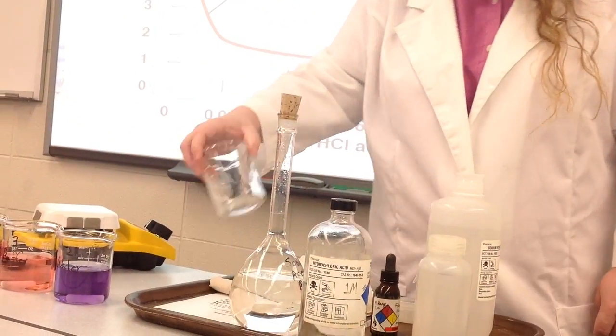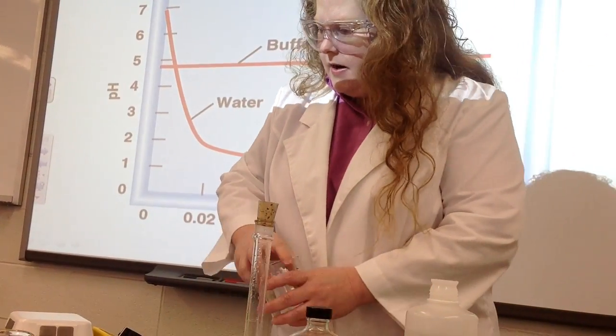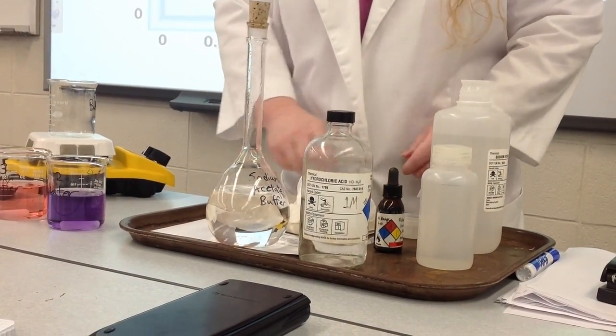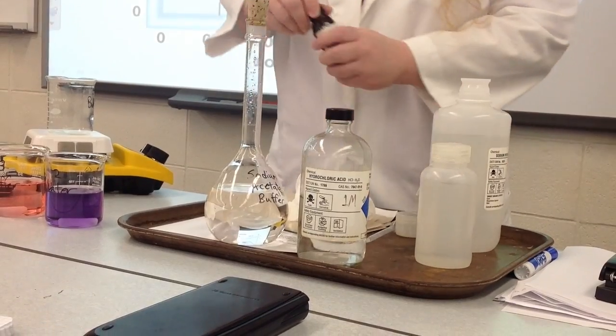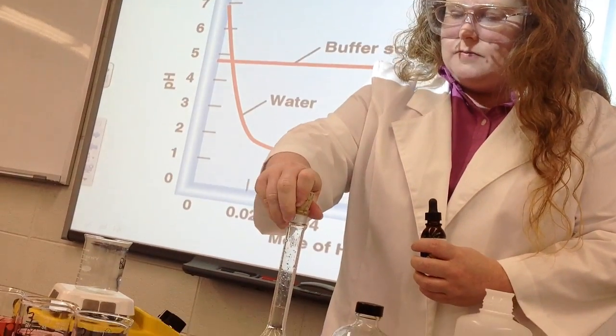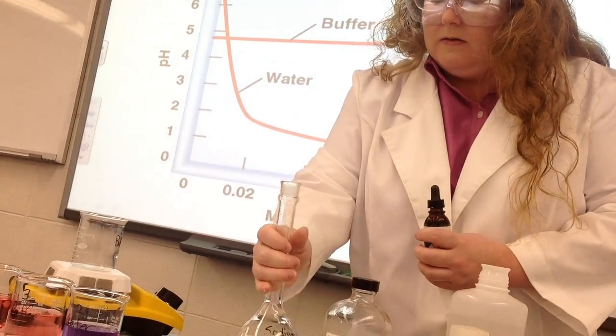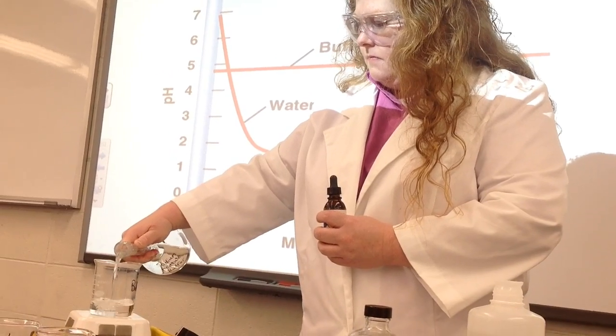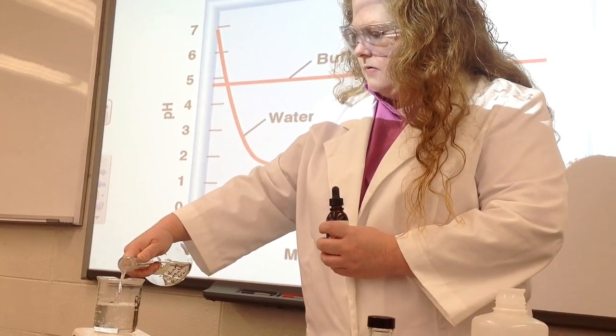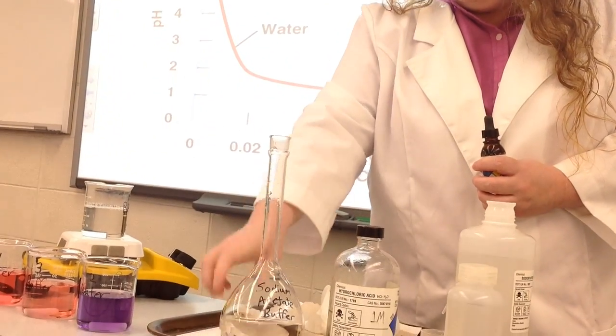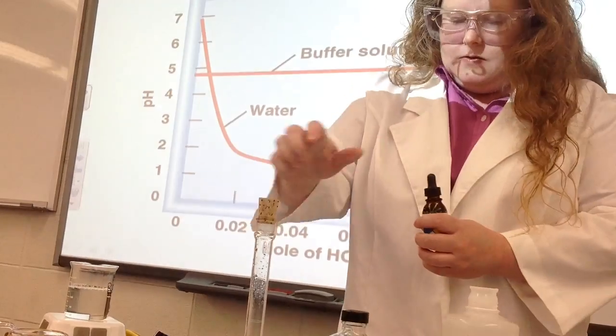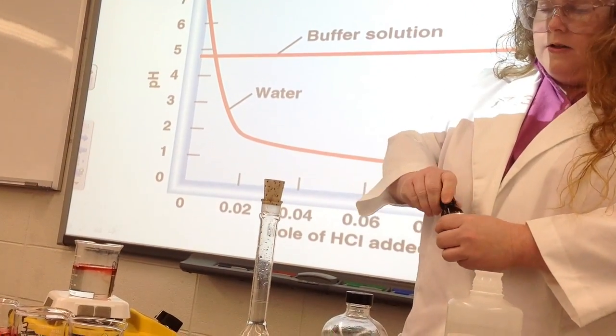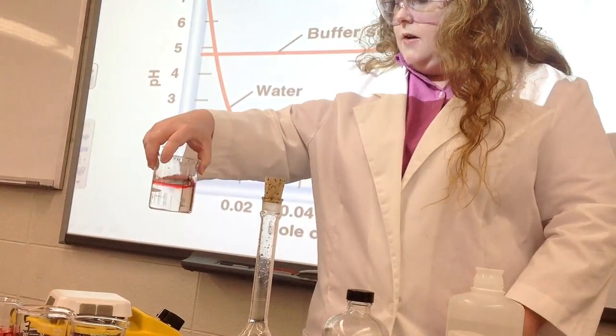So it changed pretty quickly. All right, my fourth beaker, okay. I'm going to go ahead and use, well I don't have a stir bar for this, but we'll add some indicator to some buffer in here. And again, you know, it's going to be the light pink color.